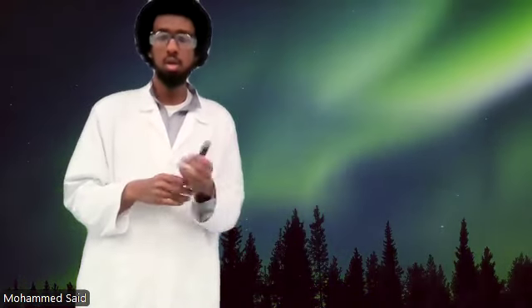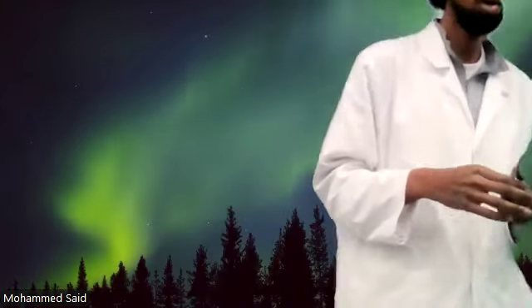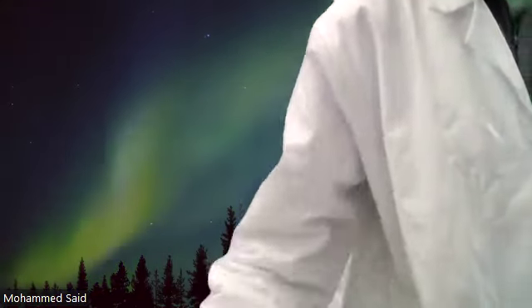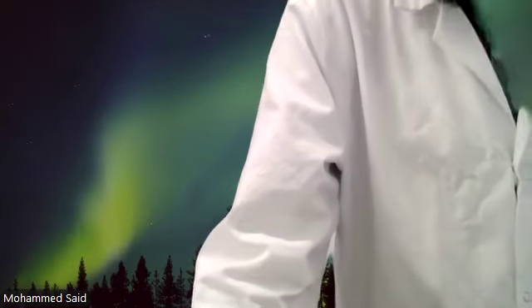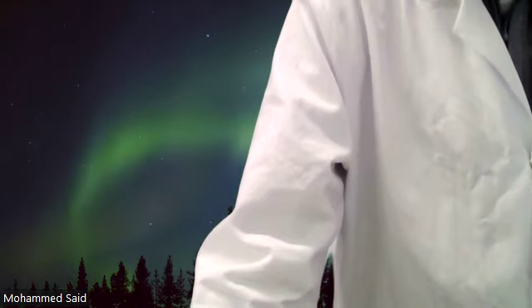So don't be concerned, even in your same practical group, if you find someone beside you has 17 minutes as their generation time at 37 degrees for viable counts, whereas the person on your right has it at like 23 minutes. That shouldn't be a problem. But I want to make sure that you're able to deduce accurately your generation time values based on the slope and results of your respective graphs. Remember, you have 4 curves. That should suffice. I know we have to get straight ahead, so let me just go straight to the practical.